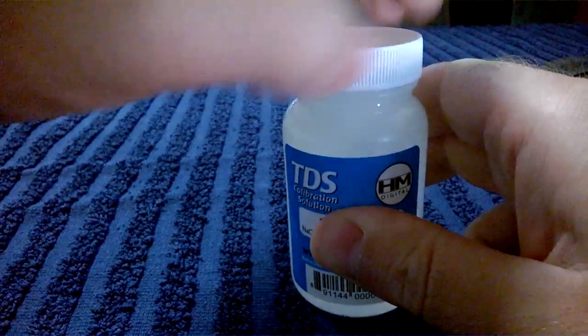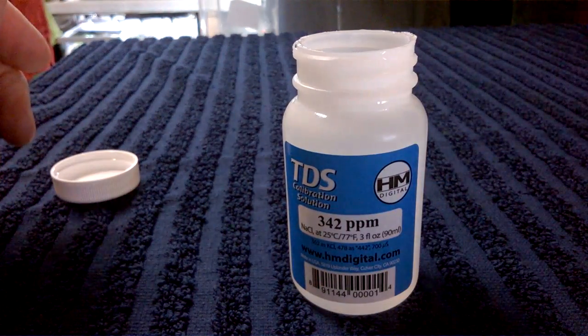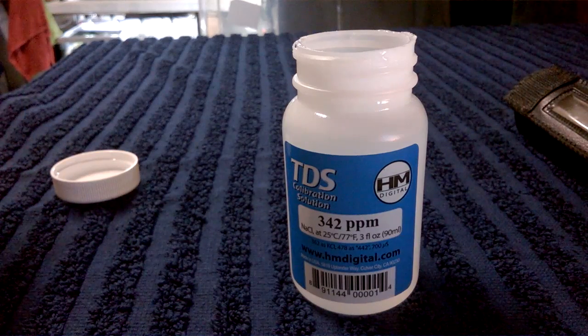I have two TDS meters here. One is kind of faulty and one isn't, and I'm going to show you the difference.